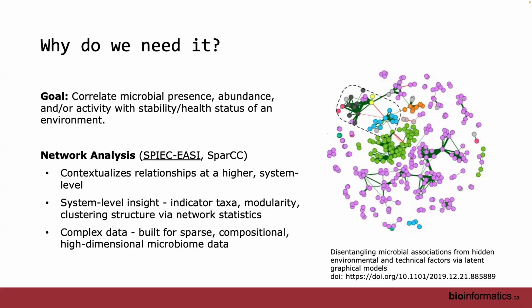So most of the networks, actually, I think all the networks I'm going to be showing today, the nodes are not samples, they're actually ASVs. And so we take all of the data that you created from your ASV table, and instead of showing the samples and showing how similar they are, like what we did with Bray Curtis, we actually show ASVs and how they are associated with each other across different samples.